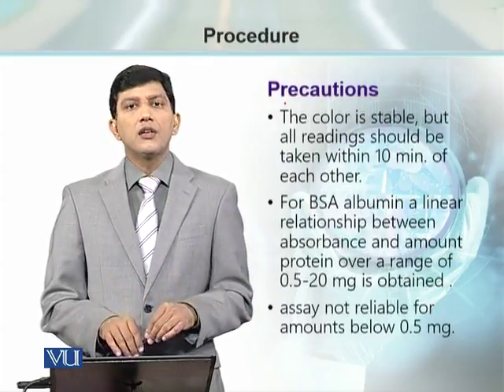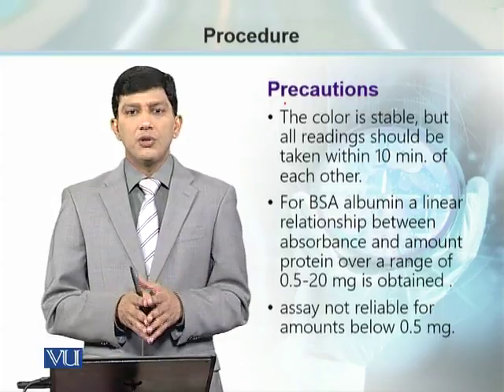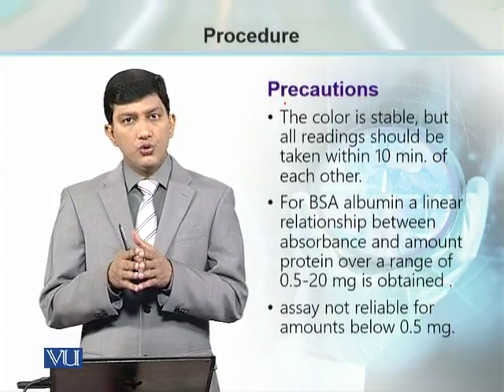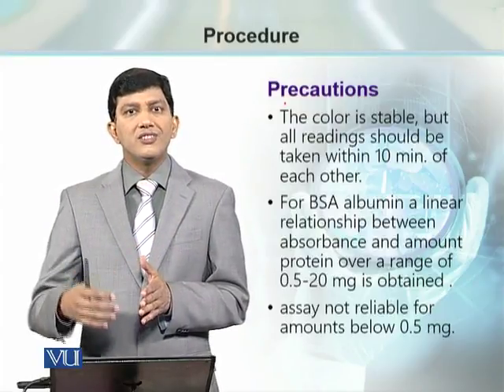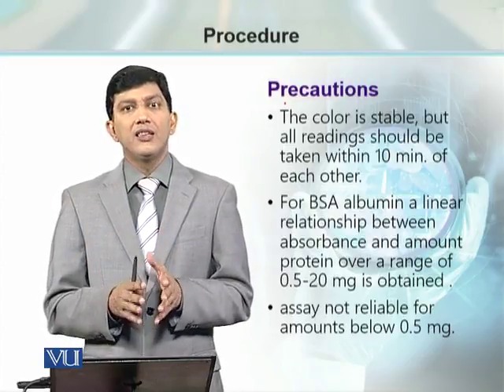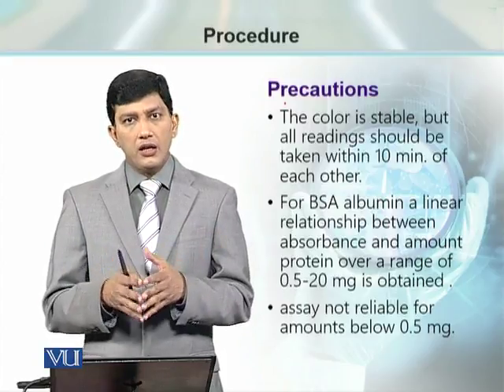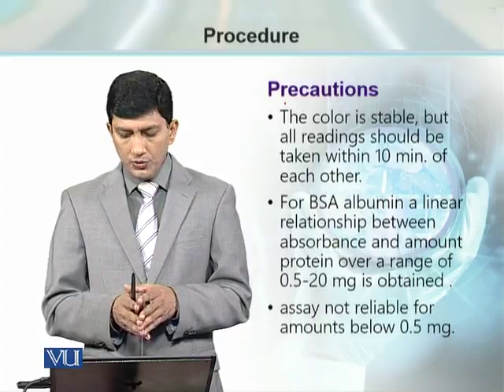इसमें एक और चीज़ का ख्याल रखना ज़रूरी होता है कि इंक्यूबेशन टाइम जो हमने अभी बात की कि 15 मिनट के लिए इसको रूम टेम्परेचर पे छोड़ दीजिए, 10 मिनट के लिए इसको रूम टेम्परेचर पे छोड़ दीजिए. टाइम शुड बी 10 to 15 मिनट्स. इसको इससे ज़्यादा प्रोलॉन्ग करने से कलर इंटेंसिटी वेरी करती रहती है, और उसके बाद जो रिजल्ट्स हैं they could not be reliable because of any kind of error that comes in that particular tubes.